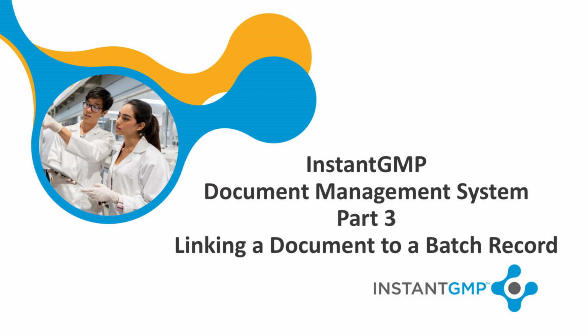Welcome back. In the last video, we added a document to the document management system. Now, let's take the next step and link that document to a master production record, and see how it flows into our electronic batch records.